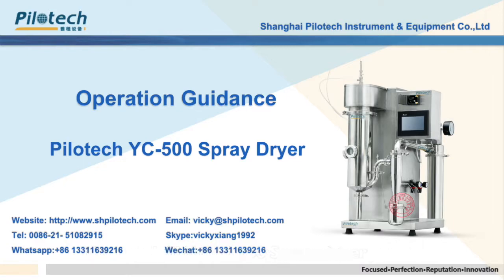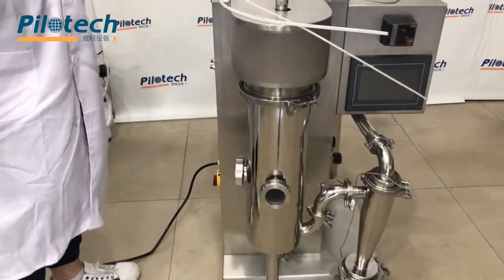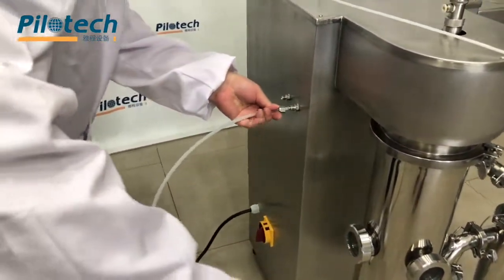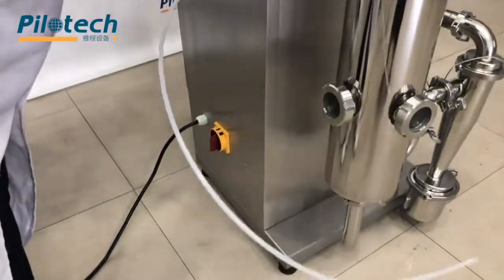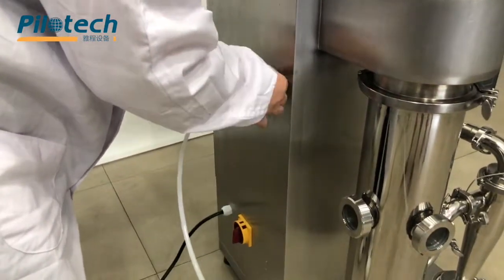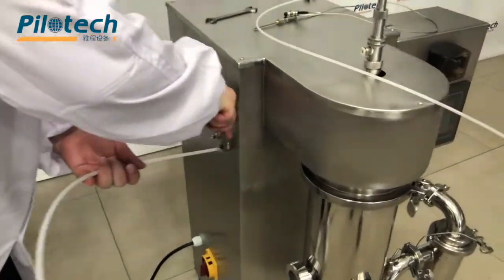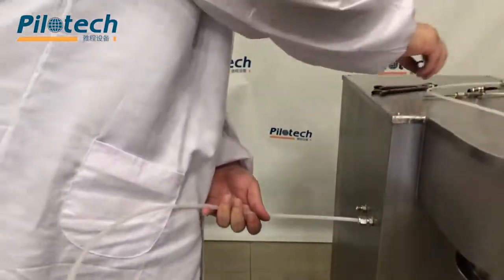Now we will introduce you how to operate the Pilotech YC500 spray dryer. Install the air tube. Install the nozzle tube.